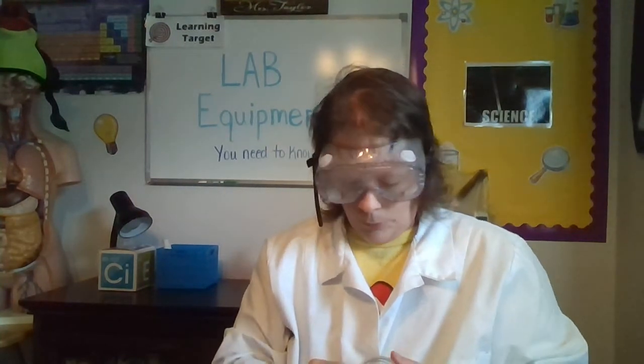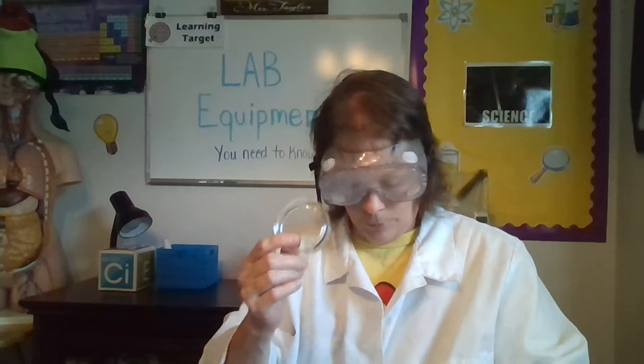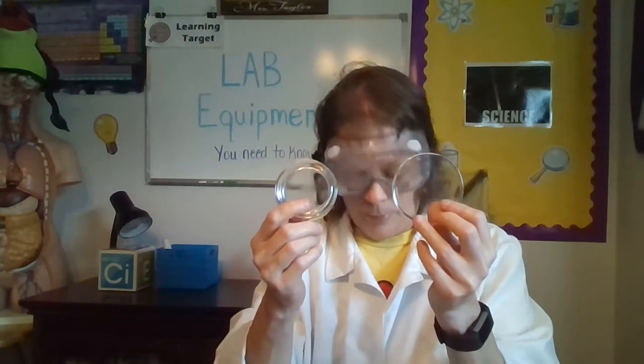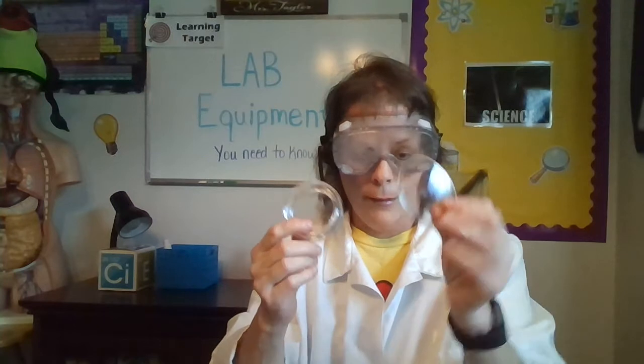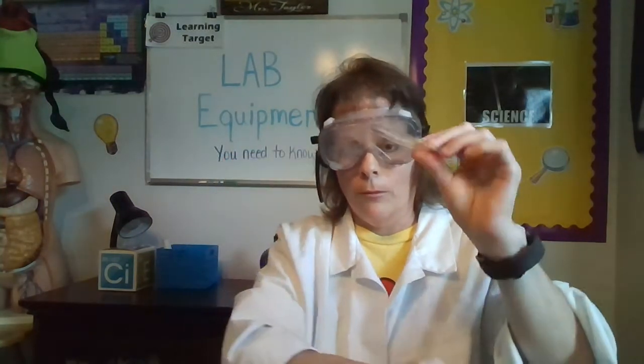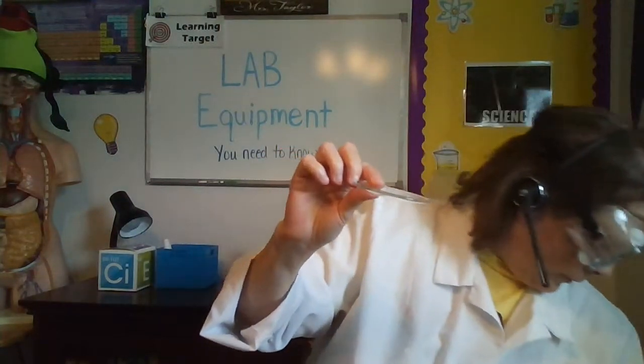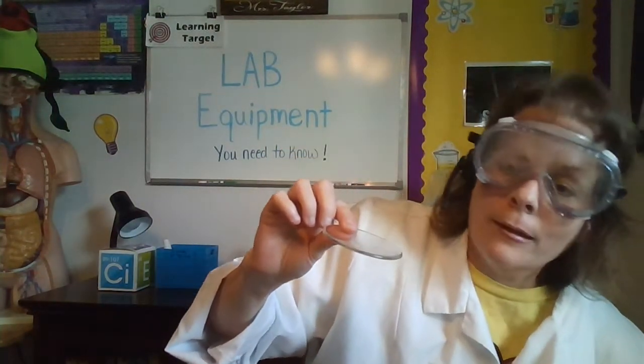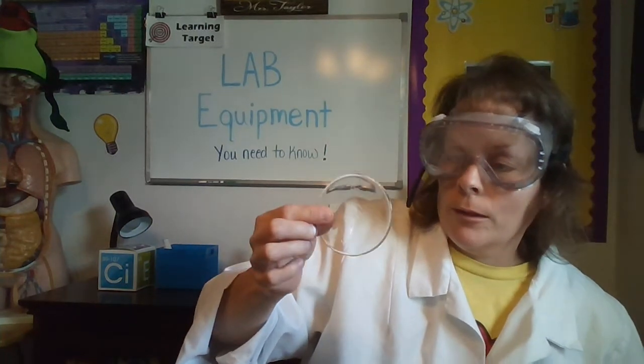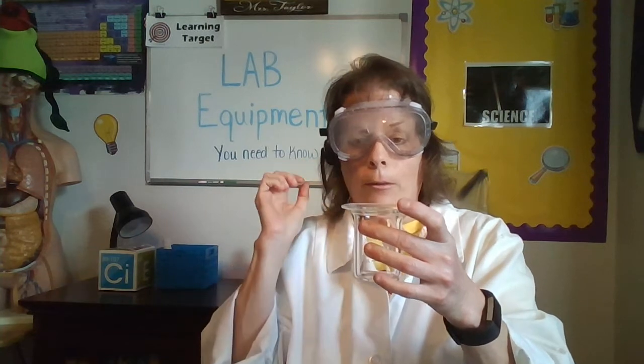I have a couple versions of watch glasses here. They are also used for evaporating, or you can be weighing things. They look a little different. This one's like a bowl almost; this is just kind of a curved piece of glass. But you can use this as a lid if you have one that's big enough. Like this little beaker right here, you could put it right on top and it serves as a lid.